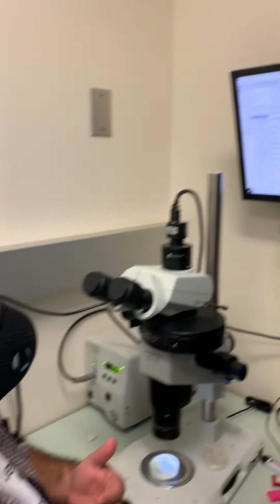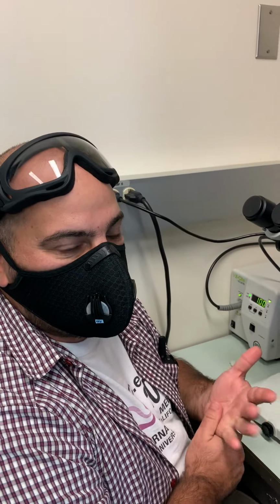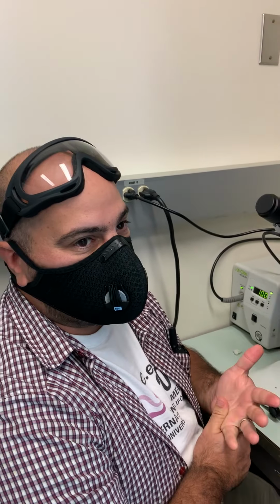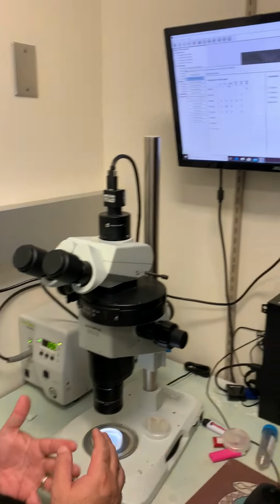The higher the resolution, the higher the frame rate, the higher the bits, the bigger the picture. The more pixels, the more bits the picture is going to be, the slower the acquisition is going to be. So you might lose some information. It will take more room in the hard drive. So you want to go with the smallest thing.